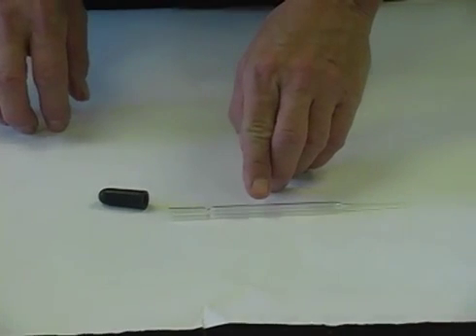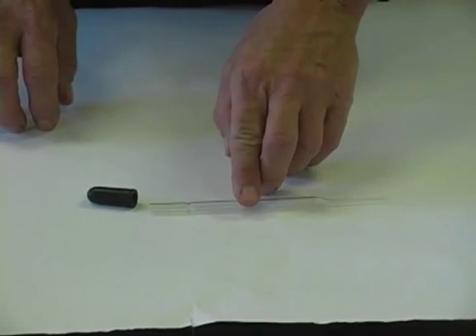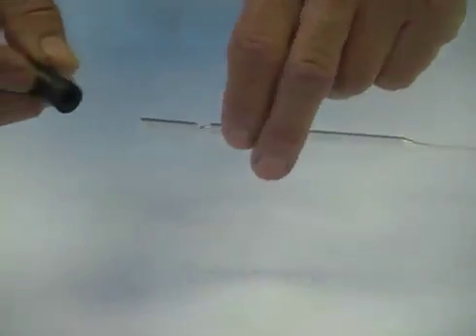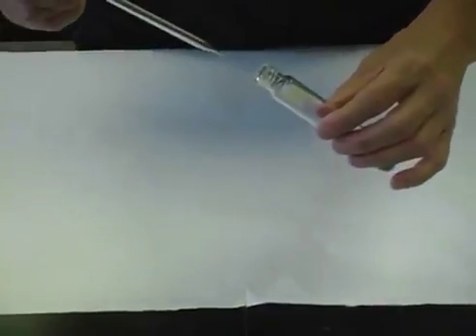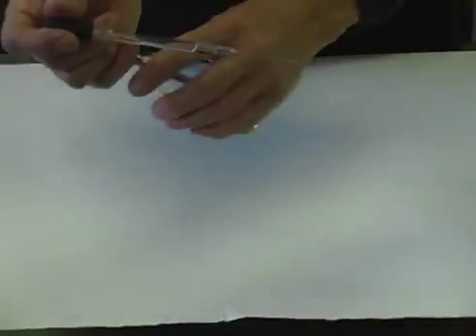Another way to transfer fluids or liquids is by use of a Pasteur pipette. These are delicate glass pipettes that can easily shatter. A rubber bulb is used. We place the blunt end of the Pasteur pipette into the rubber bulb and can then transfer fluids from one container to another.